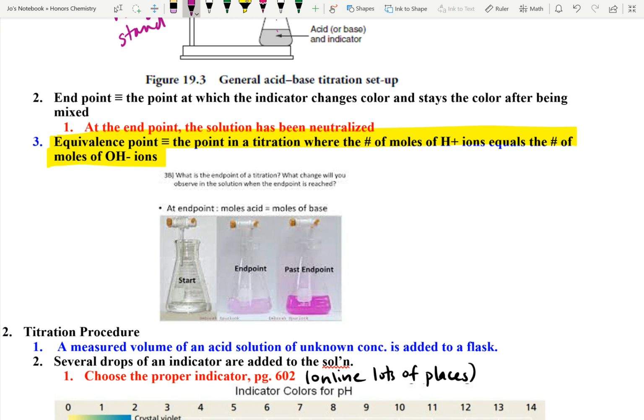So this is underneath. It shows your initial solution starting to be clear. This is using phenolphthalein as the indicator for this example. That indicator is often used for a weak acid, strong base titration. And so you would titrate, and it would get a little bit pink, and then you'd swirl it and it would go away.